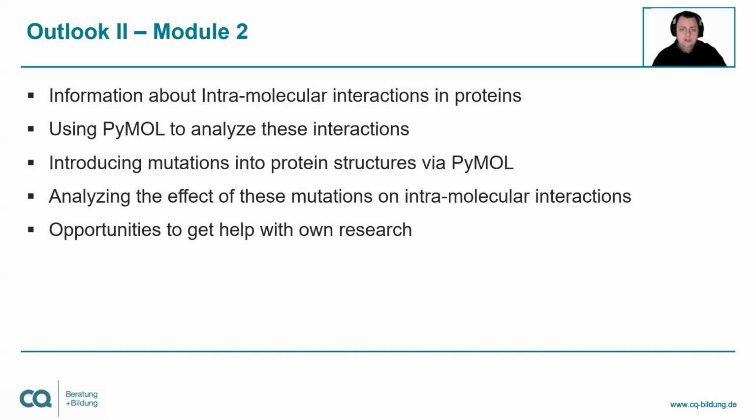The second module then focuses on mutational studies and thus starts with an introduction into intramolecular interactions in proteins. What kind of interactions are there? What kind of distances and parameters are important to see whether this is really such an interaction or not. Participants will learn how to analyze these interactions with the help of PyMOL.